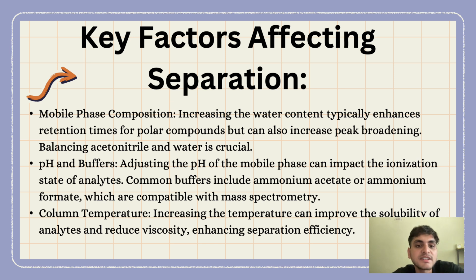So what are the key factors affecting separation? The key factors that affect the separation are mobile phase composition, in which if we increase the water content, it enhances the retention time for polar compounds, but can also increase peak broadening. Thus, balancing acetonitrile and water becomes very crucial.